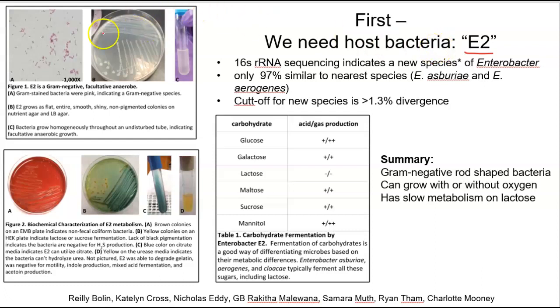And all of the bacteria that we collected, the students had to isolate it on a plate. And so you grow it on a plate, and this is the bacteria streaked on the plate. You can kind of see what it looks like here, and you get these colonies. And they pick a colony, and then they streak it on another plate, and they pick a colony from that plate and streak it again. And so you streak it multiple times to make sure that it's pure and it's isolated. And from then, you can look at it under a microscope, and that's what we did here.